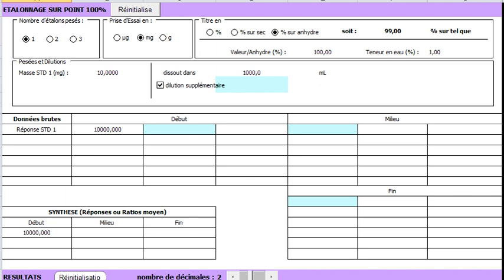Here we select the unit of the standard to be weighed. It can be chosen in micrograms, milligrams, or grams. Here is defined the purity of the standard. In this case, the 100% purity concerns the anhydrous substance.